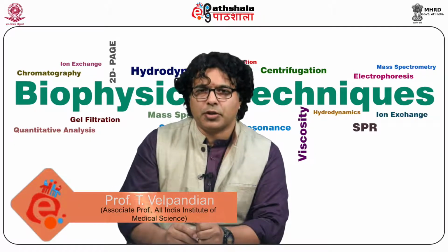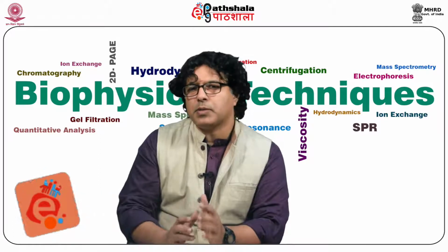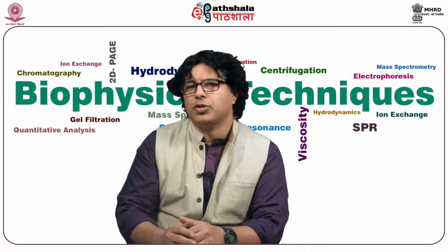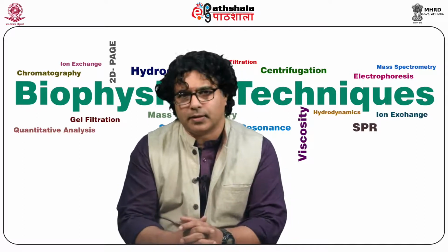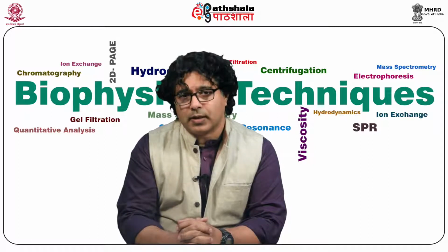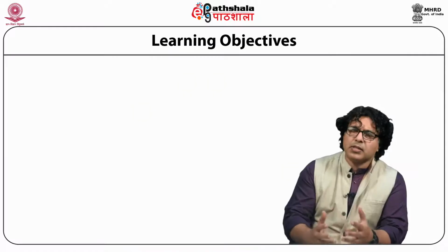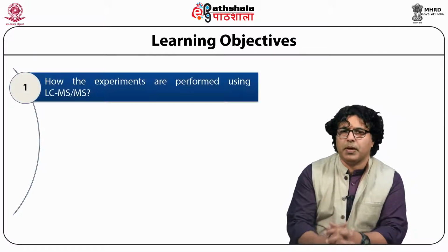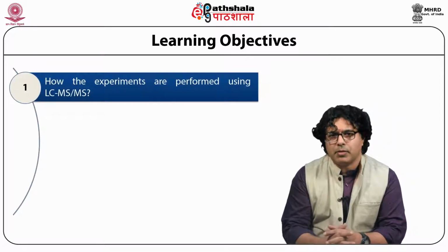Today I am going to talk to you about working with a mass spectrometer, especially the triple quadrupole tandem mass spectrometer. I'm going to tell you about the working and the other things done. This is for the paper of Molecular Techniques in Biophysics 1. In this module, you're going to see how experiments are performed using LC-MS.